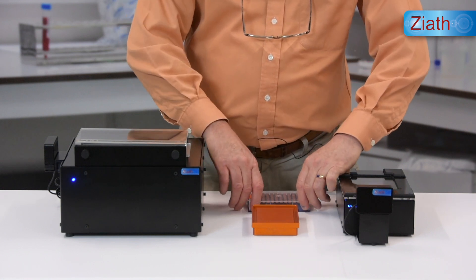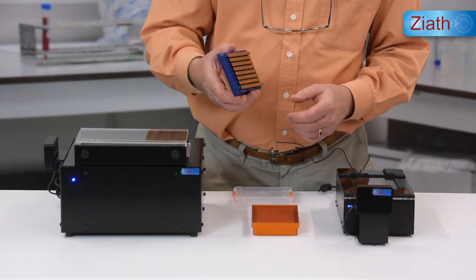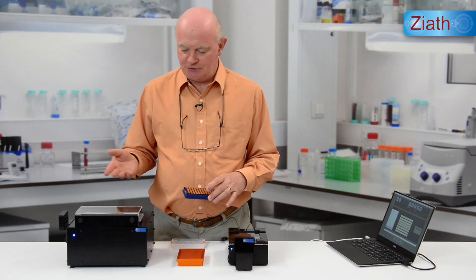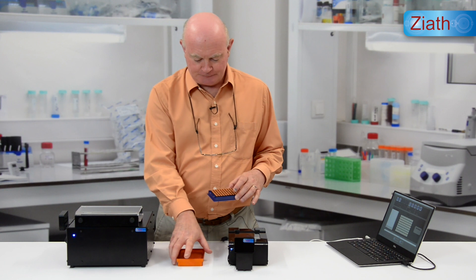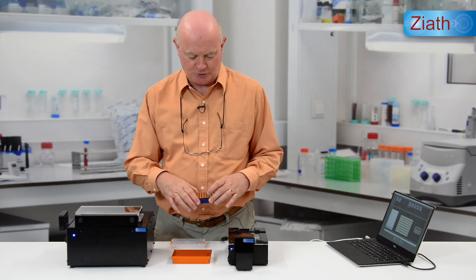The rack is released like that from its lid, and what you'll see is that the tubes are actually held in the rack, which can make picking them using the Mohawk tube selector slightly difficult. To get over this problem we have a special adapter, and I'll show you how that works as well.